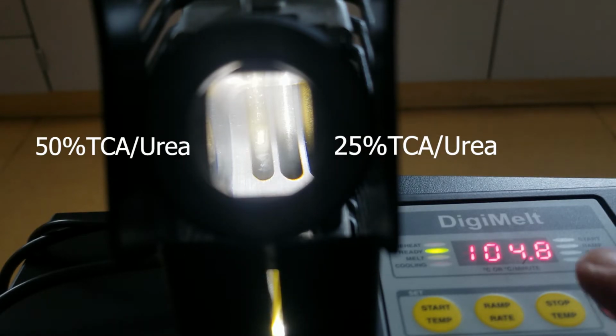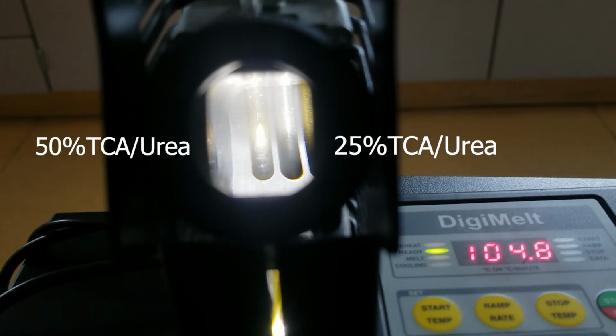You may notice here I set the starting temperature a little bit lower than last time because I have the most impure sample going in, so it should have the lowest melting point of all five samples here. And it did not melt right away the second I put it in there. Had that happen in the past. All right, now we sit back and wait. Just so exciting. Yeah, looks like the 50's already melted.